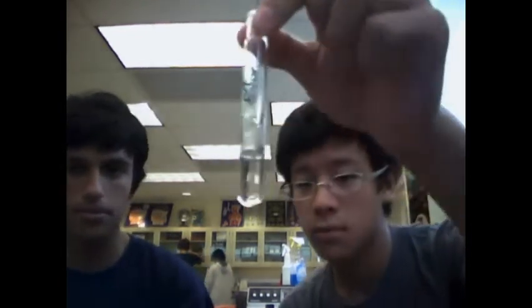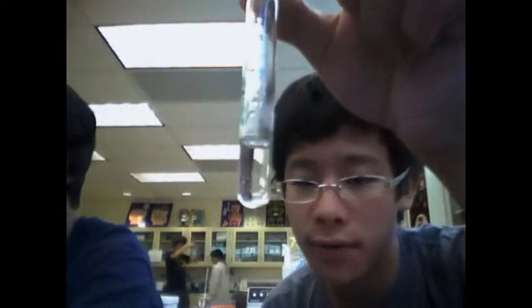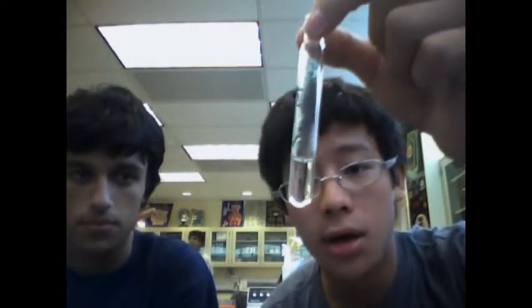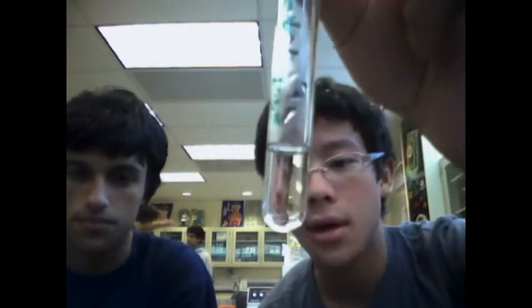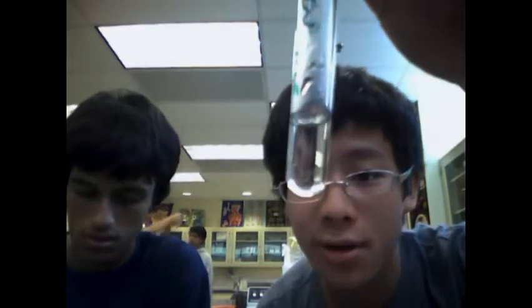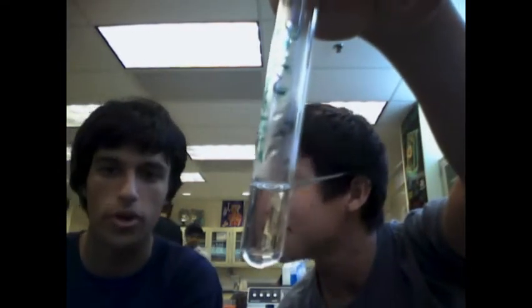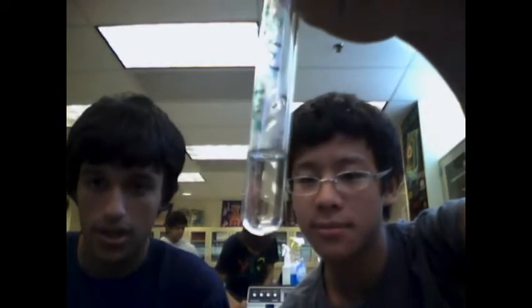And here we have the final test tube. 1 milliliter of catechol and 1 milliliter of water. Now we didn't add catechol oxidase in this test tube, and as you can see, there is no brown color because we didn't add the enzyme, so there is no benzoquinone produced. So, if this was at a higher temperature, then you may have seen the benzoquinone reacting, because you would have gotten more energy.